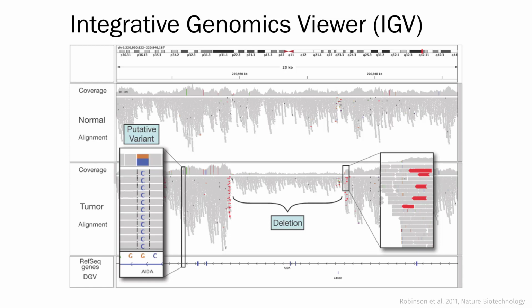But then what they plot on top are these colored lines, which represent SNPs and how frequently they see certain variants. A green line, I don't know what green is, there's no example, but the blue and the orange that you can see here is this position. It's essentially information about what variants are found in the reads that map to this position. So these are tracks that are on top of each other.